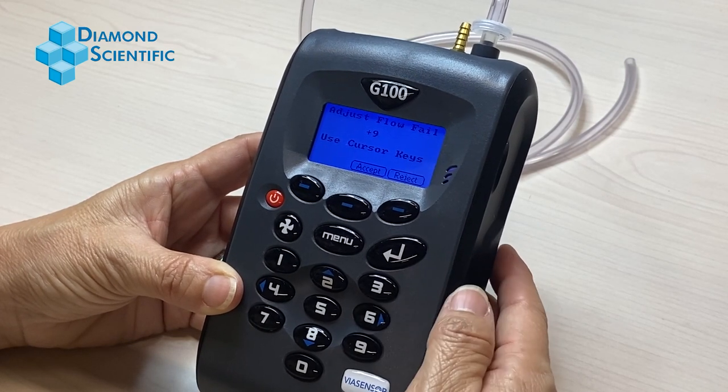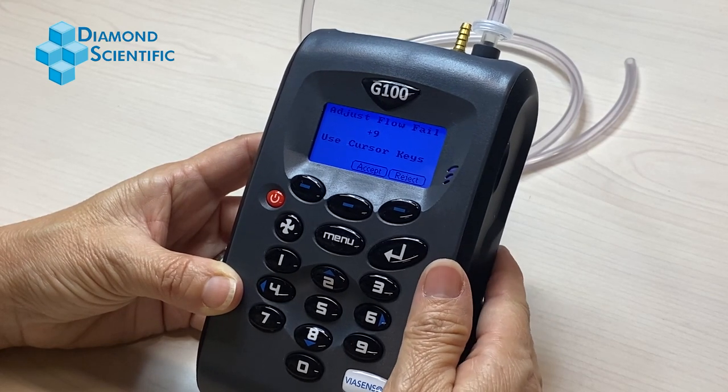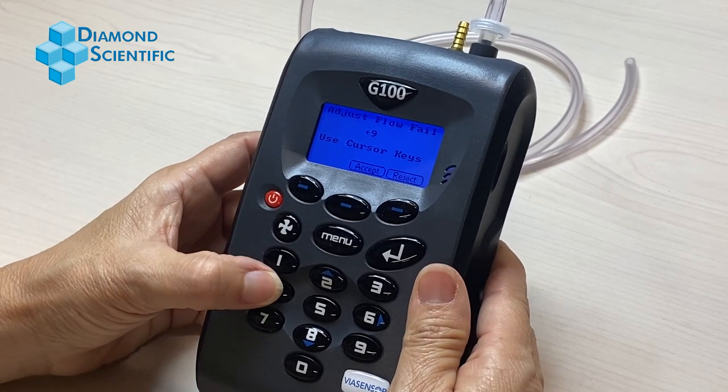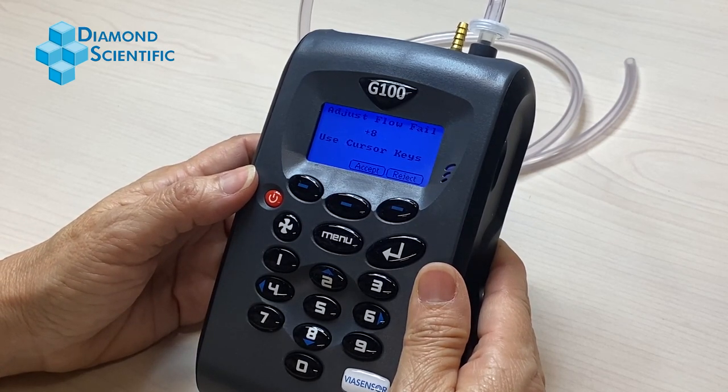Use the right arrow key, number 6, to adjust the number up so it is less sensitive. Using the left arrow key, number 4, adjust the number down so it is more sensitive.